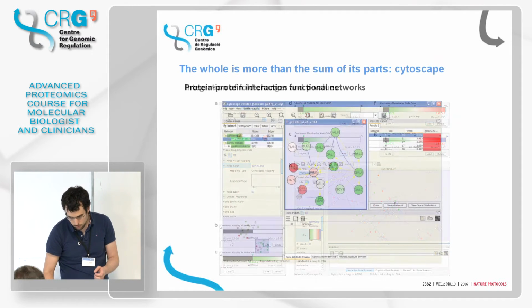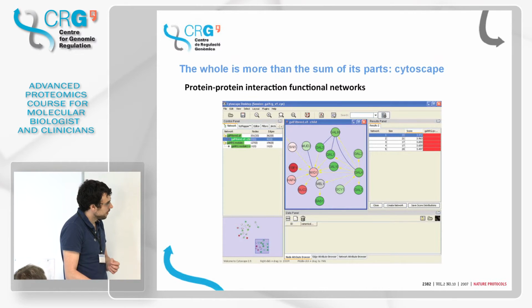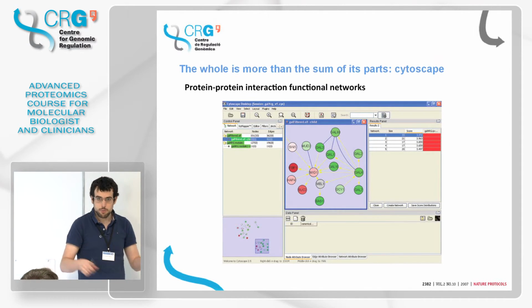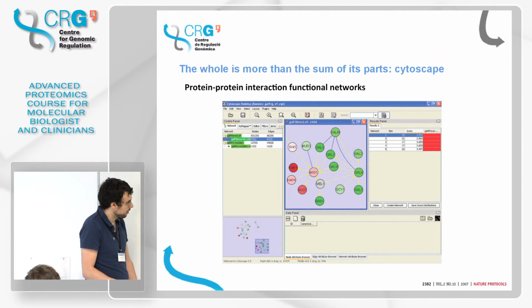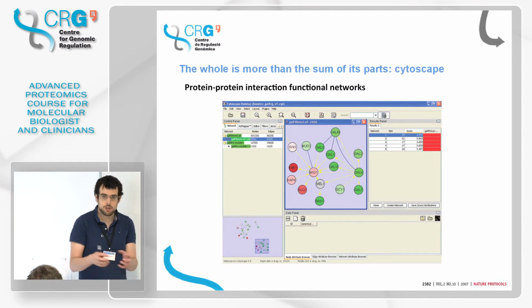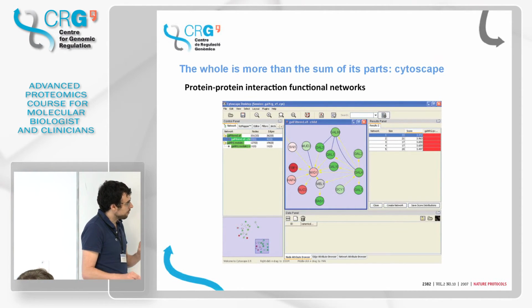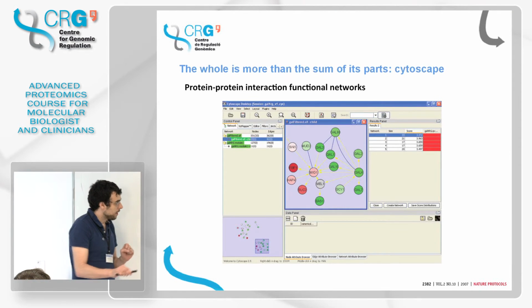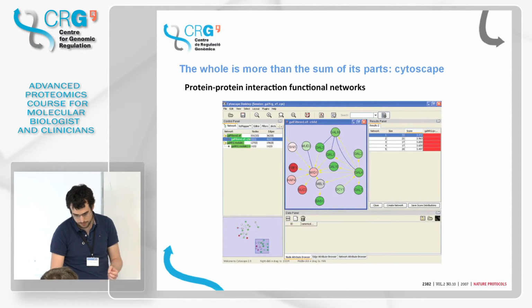And then what we can do actually is also isolate subnetworks. Say, well, you know, I had a big network of 1,000 proteins, but actually this batch of 15 proteins are changing, most of them, like here all in green or in red. They are highly connected among them. So this is a functional module that is altered during my treatment, right? And then I can make a nice figure about this and discuss why this module is highly regulated and in which functions it's involved. Okay?